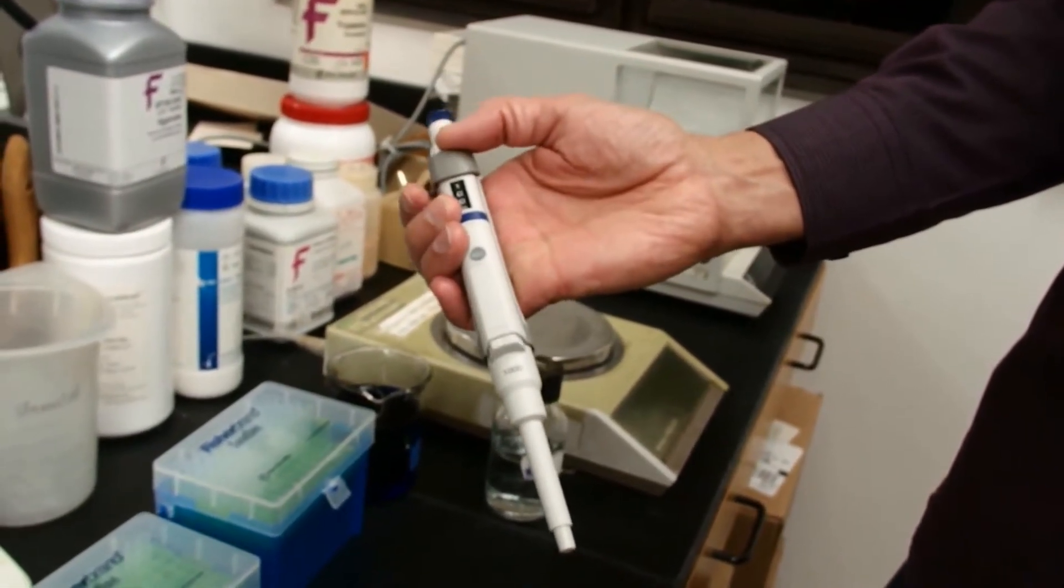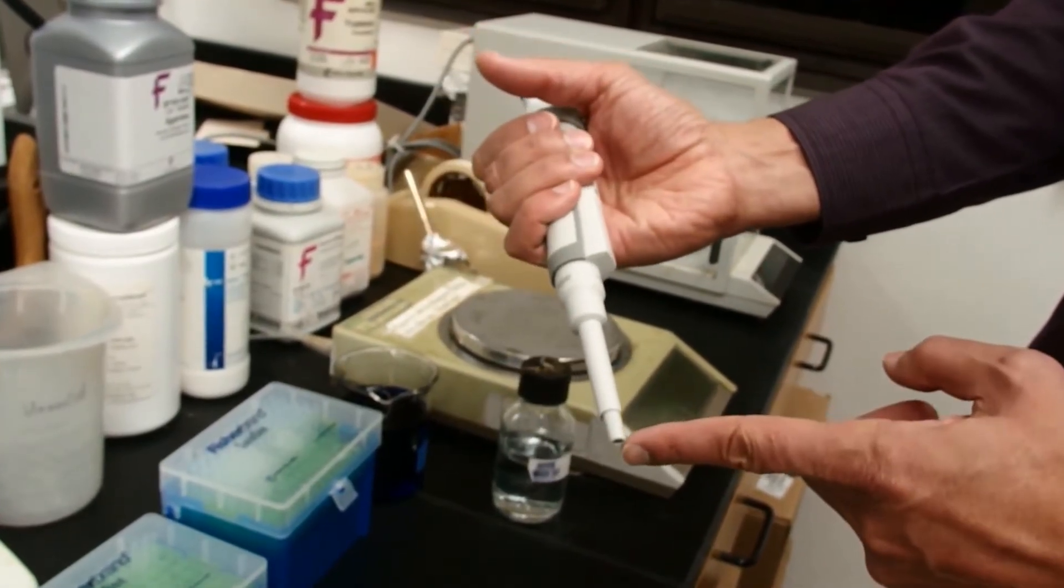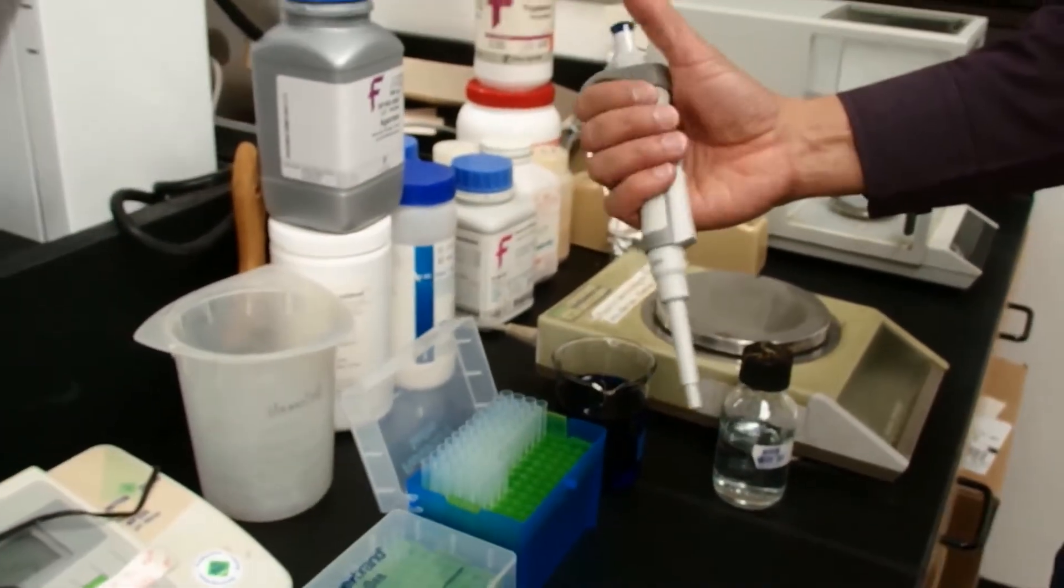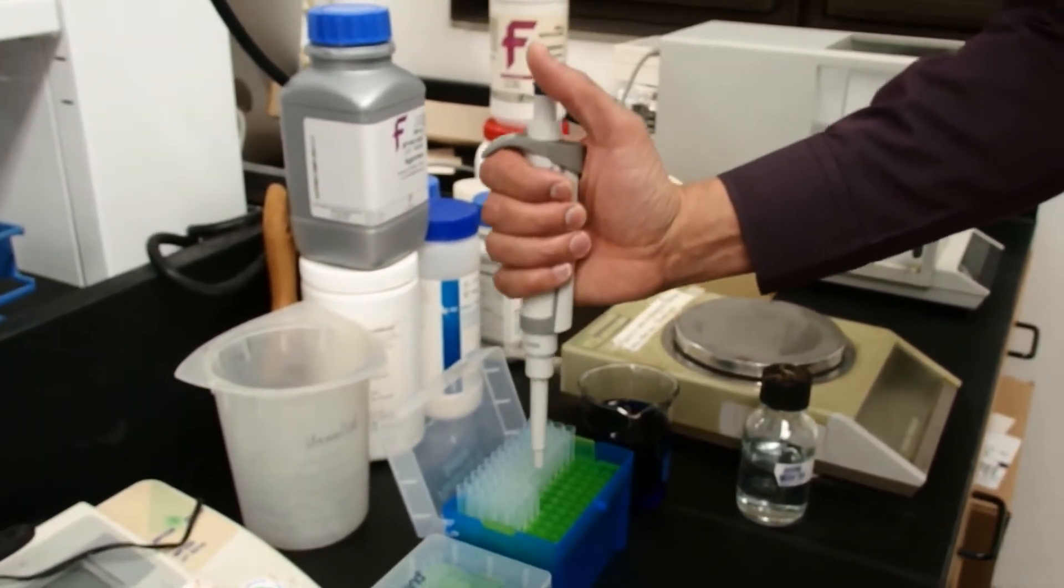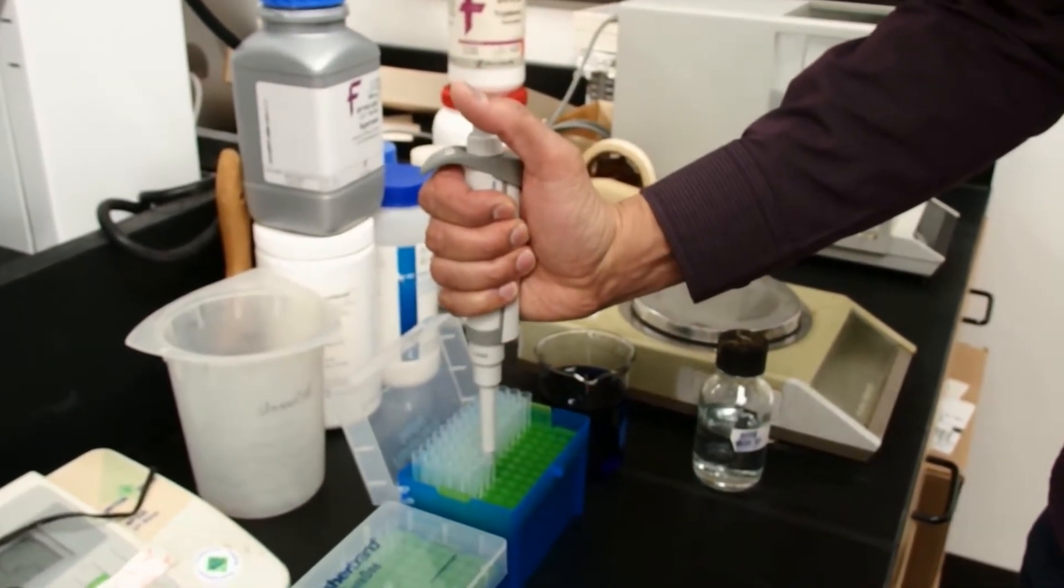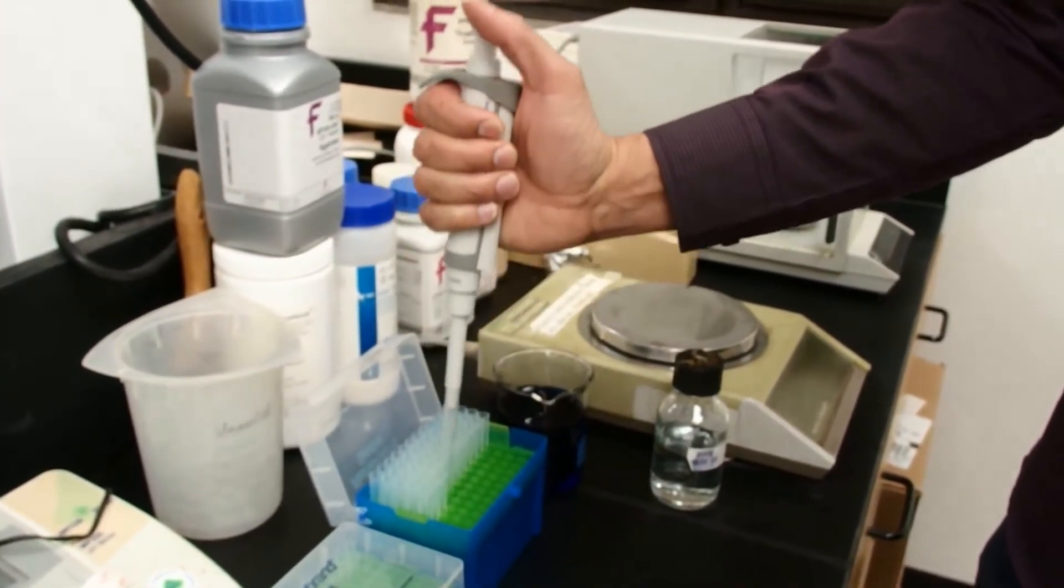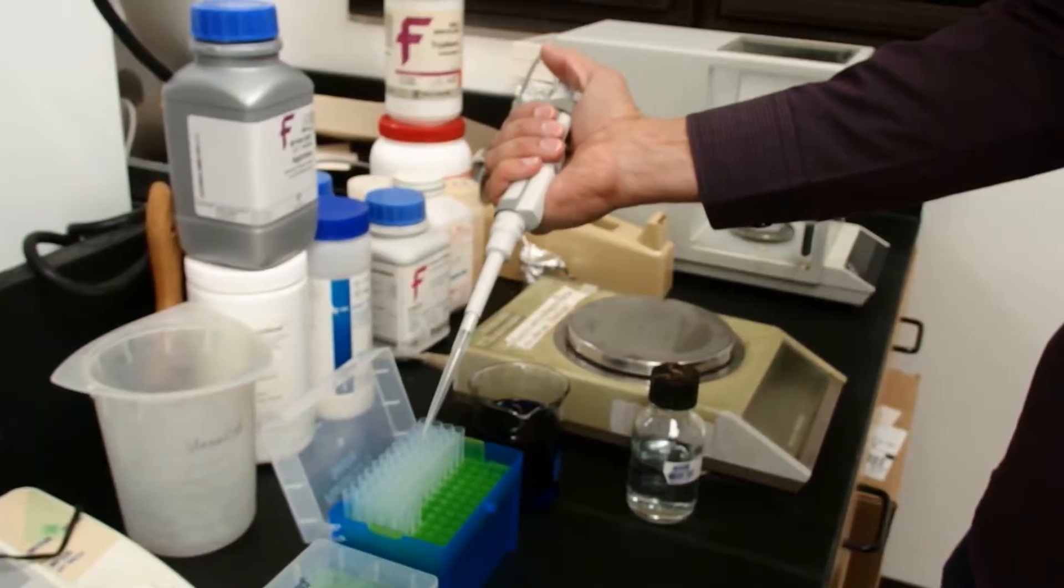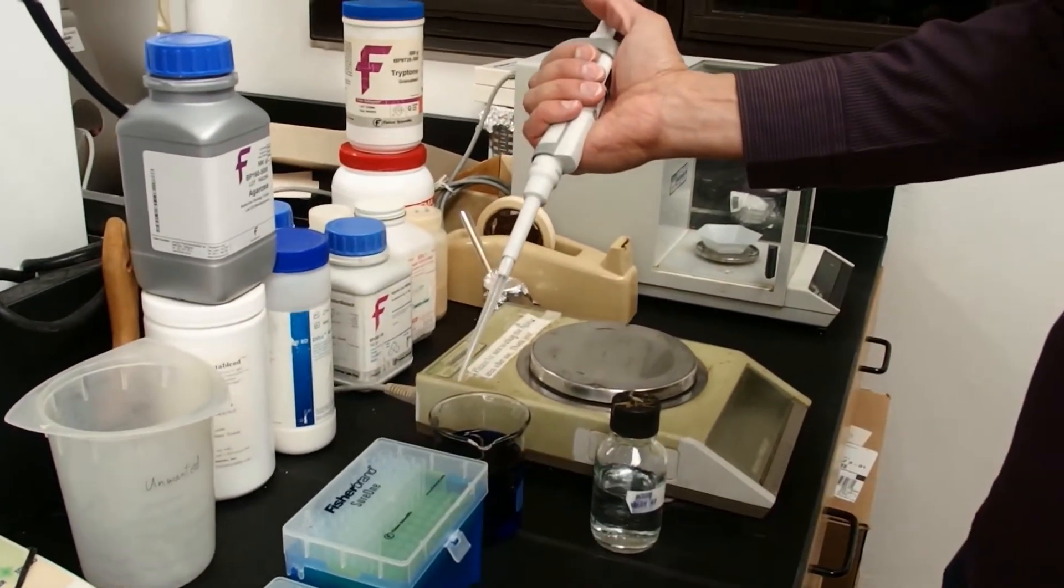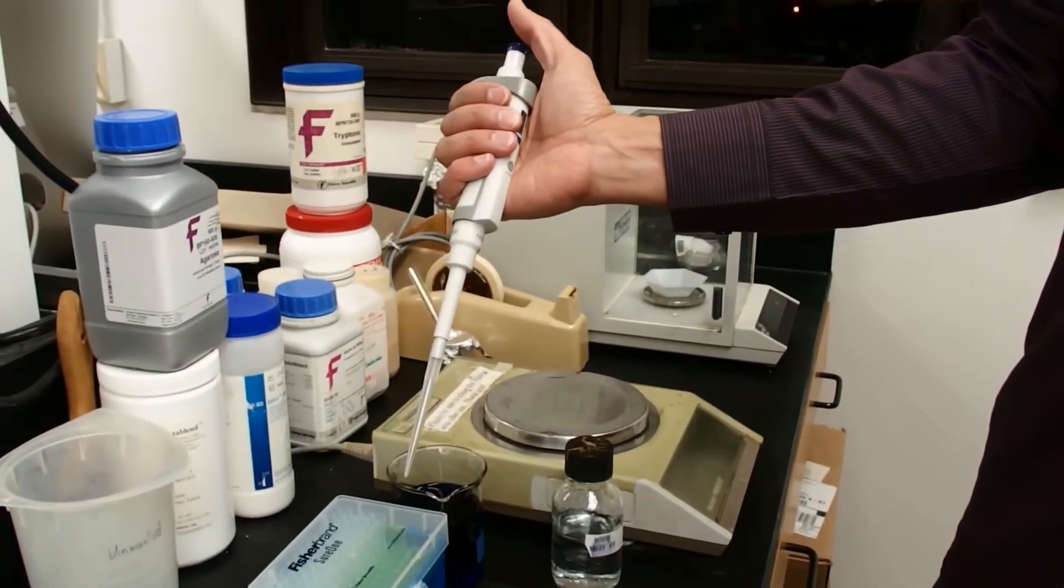It also has this part here that allows us to eject the tip. The tips go on here. They each have their own tips. We should press firmly, but not so firm that you break the plastic. The objective here is to get an airtight seal so that the tip doesn't leak. Pipette boxes should be closed when not used so that dust doesn't fall into these very clean tips.